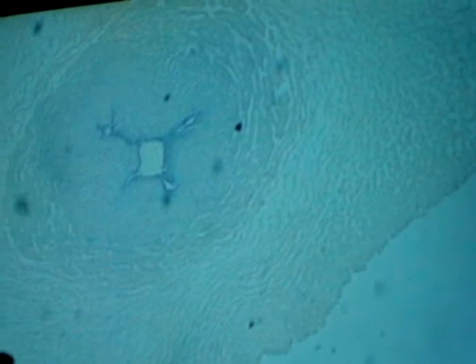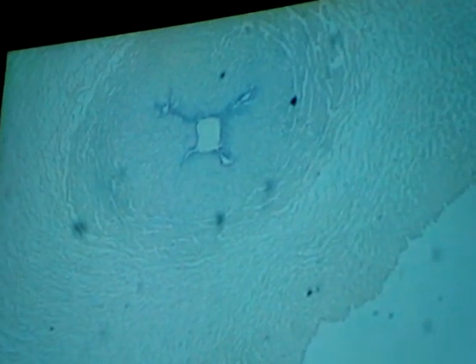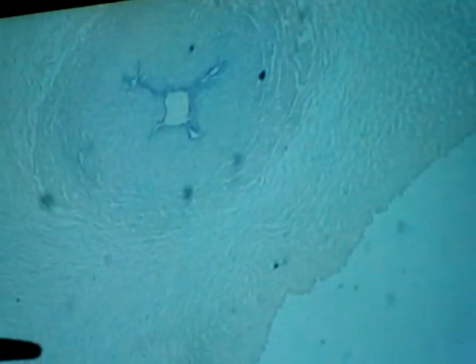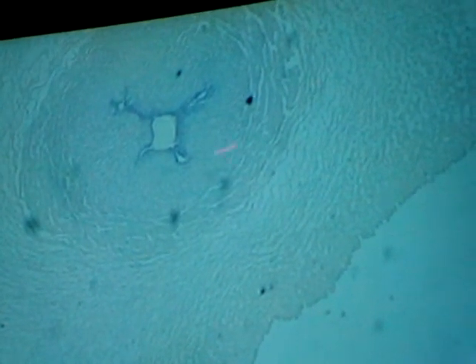And then we have the mucus tissue, which is all the Wharton's jelly, is what they'll call it, which is all this right here. It's all Wharton's jelly. And then the very outside of it, we've got it listed on there as the amniotic epithelium, but it's just the outer layer that surrounds the umbilical cord. So the amniotic epithelium, the Wharton's jelly, the umbilical artery versus the umbilical vein.